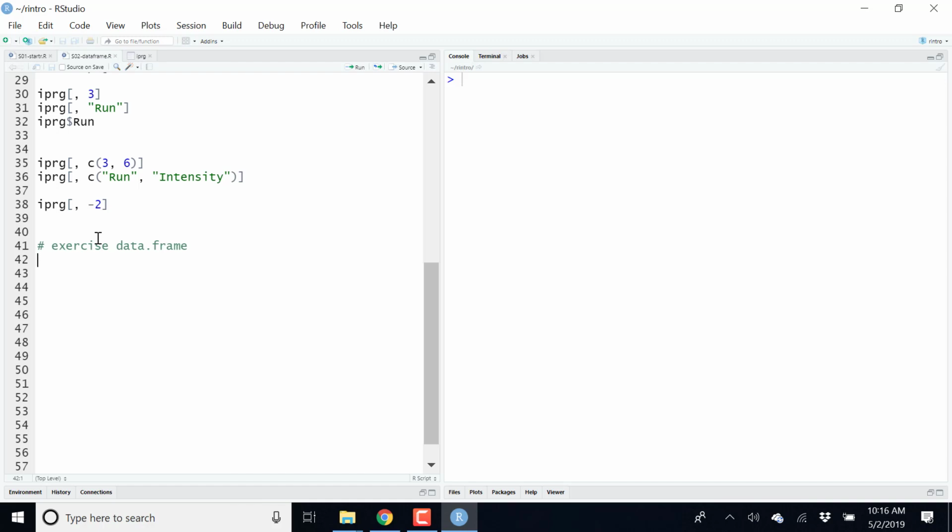Not to repeat exactly what you do, because the code says what you do, but maybe to define some structure in your scripts, because they tend to become very long, very quickly. So put some structure, or more to describe why you do things. Not exactly what you do, because that's what the code says, of course, but why you do things. That's something we tend to find.